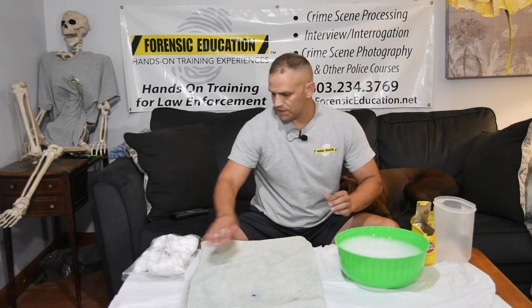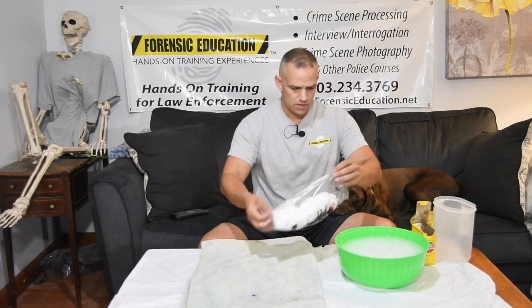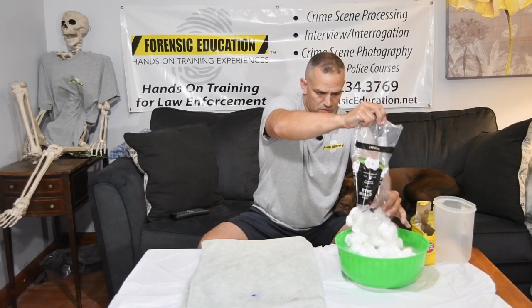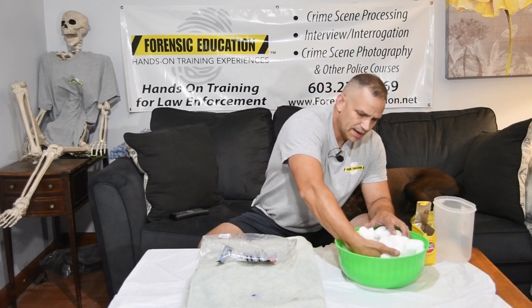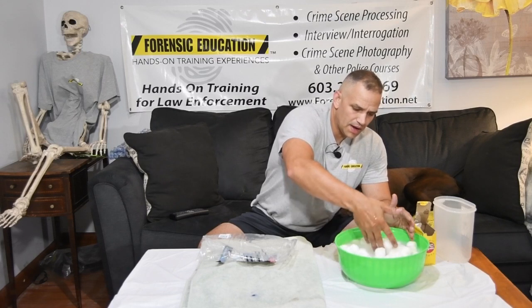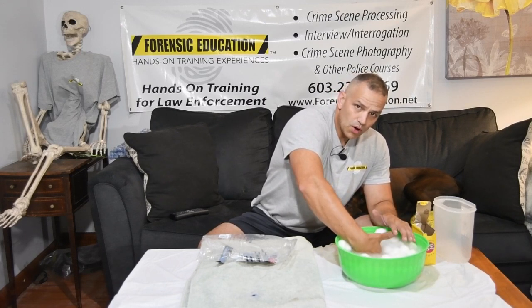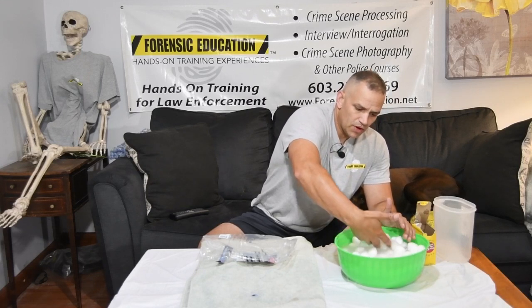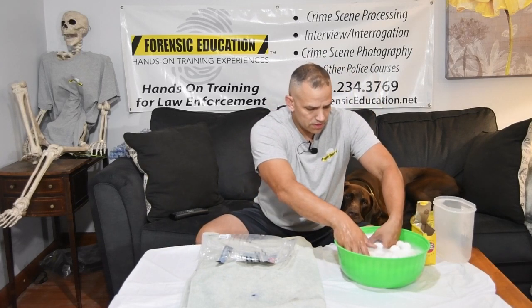Now that that's done, we're going to take our cotton balls and put those in. You have to be careful with this part because you want them to absorb the water and the baking soda, but you don't want them to fall apart, so you have to be really gentle.